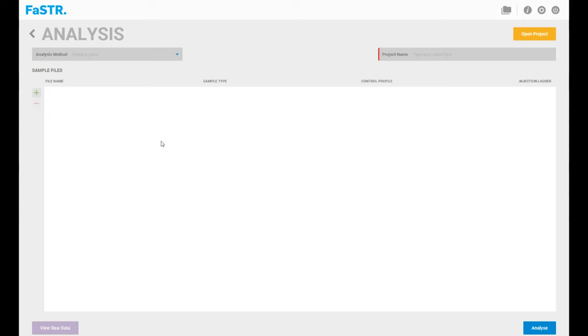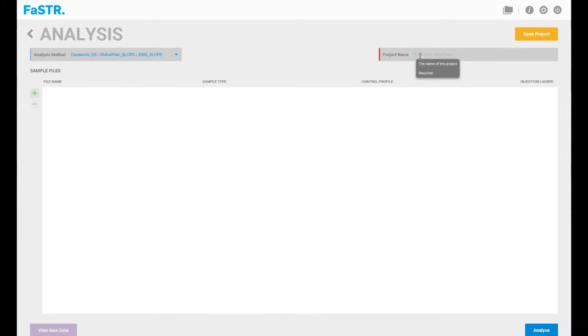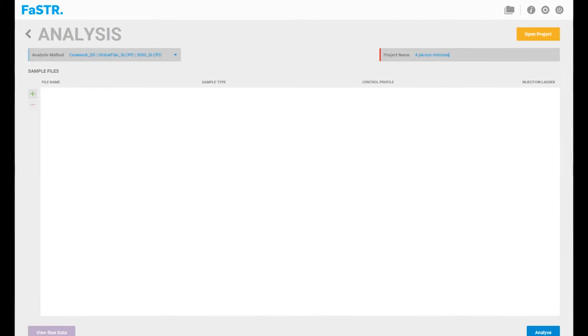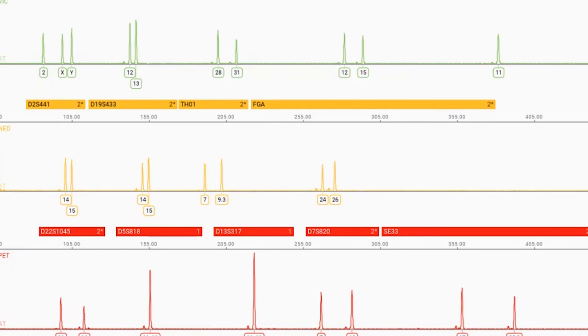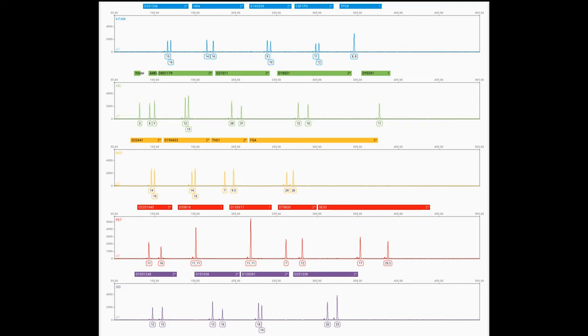The DNA analyst evaluates the data to determine if sufficient data was developed from the samples. If enough data was recovered, they determine the number of contributors in the DNA sample. DNA samples often contain DNA for more than one individual. This is called a mixture.